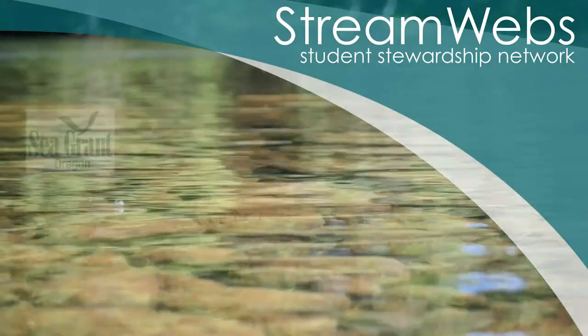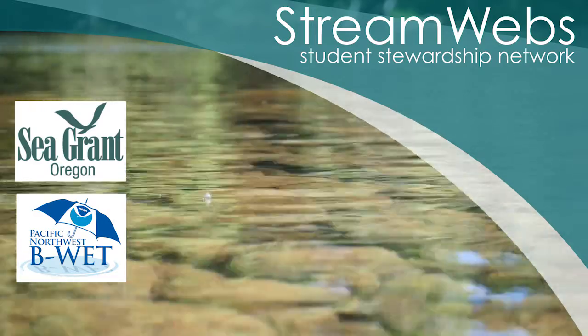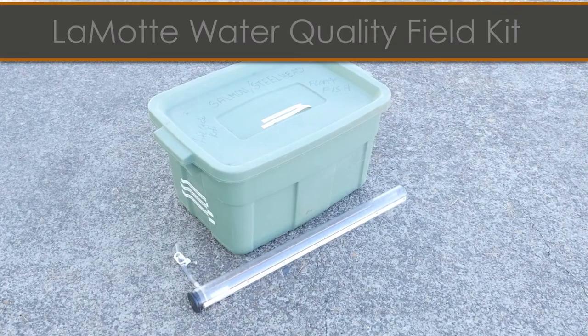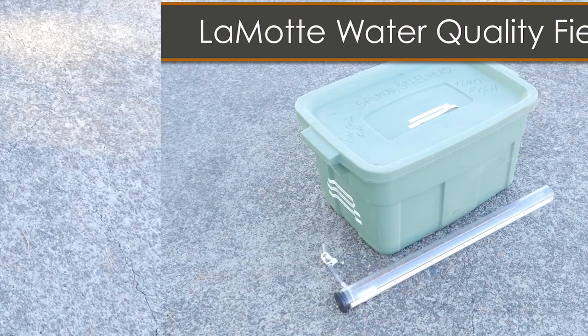The StreamWeb Student Stewardship Network, which is administered by Oregon Sea Grant, has various resources available for you to use in the field with students. In this video, we are going to take a look at the contents of the LaMotte Water Quality Field Kit. Our goal is to provide an overview of how you might use this kit in the field with students to teach them about water quality.